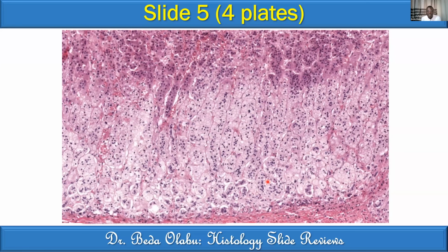The second zone consists of cells arranged in cords, which are in a columnar morphology. The cords take a columnar morphology. They are long cords in columns, like that one, zona fasciculata. The columns can be 1 cell thick, like this one, or 2 cells thick, like that one. And between the columns are vascular channels, these ones. So this is a column, that's another column. These are vascular channels.